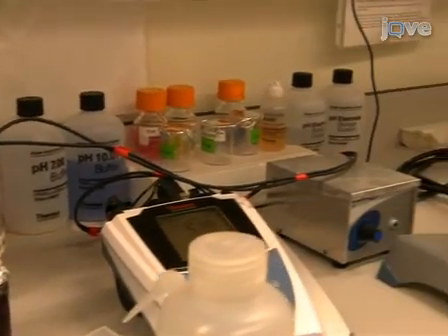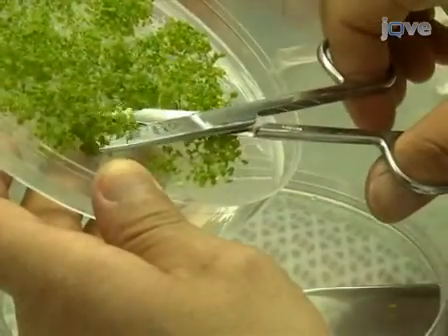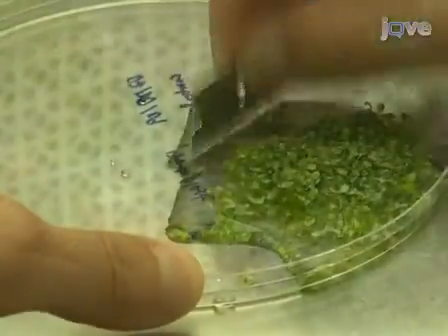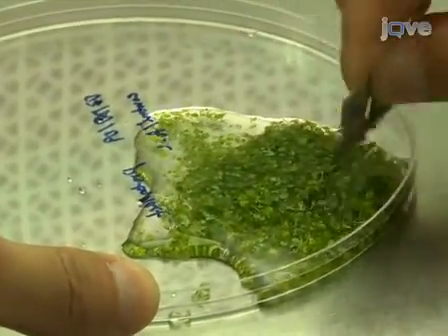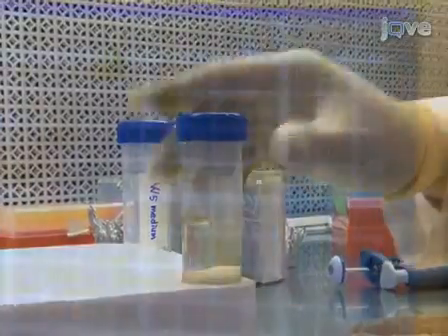Hi, I'm Zhiyang Jai from the laboratory of Olena Watamanuk in the department of Crop and Soil Sciences at Cornell University. Today we will show you a procedure for isolation of intact protoplasts from 14-day-old seedlings of Arabidopsis thaliana. We use this procedure in our laboratory to study the subcellular localization of proteins of interest, for isolation of intact organelles, and for functional analysis of genes using double-stranded RNA interference. Let's get started.